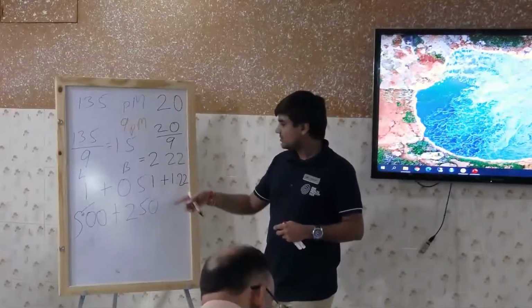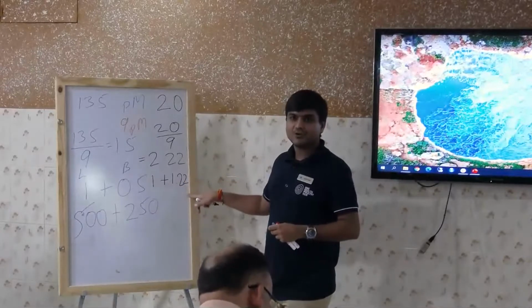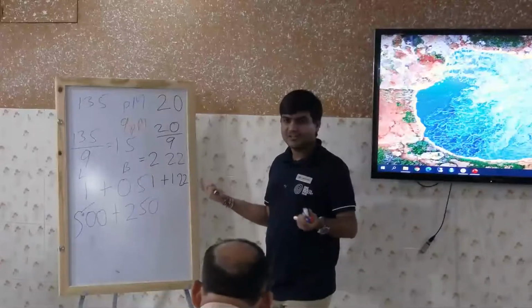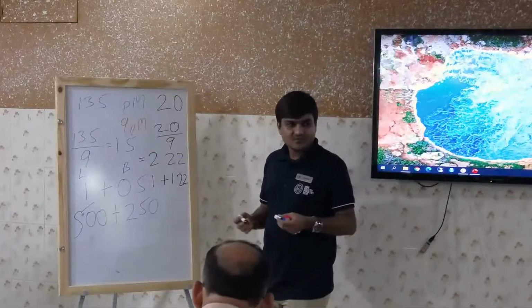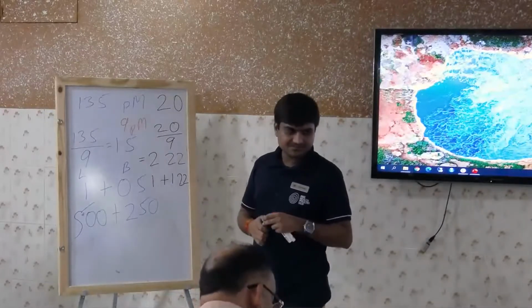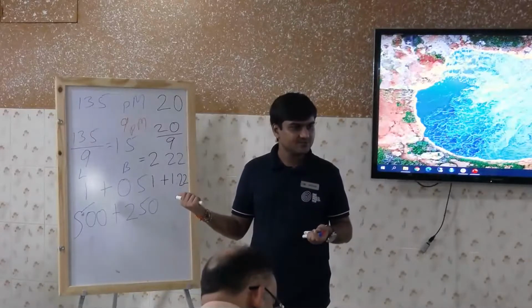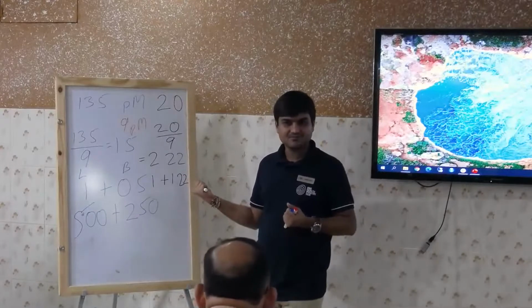Again scale it up, 400 microliter of library and 488 microliter of buffer. Fulfilling all the conditions? 888. Minimum 650, final concentration 9 picomolar, and exact without any decimal.